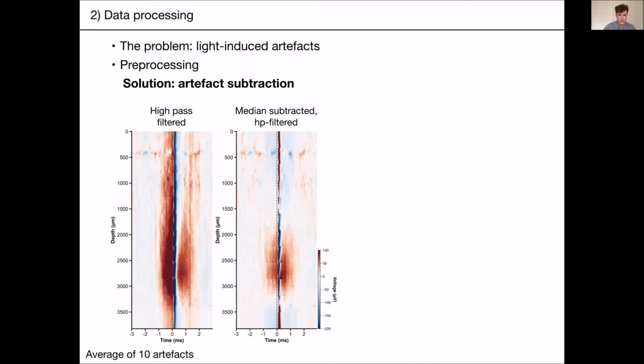So you can see here that you have chunks of channels which seem to be correlated with each other, and you have hard transitions between these chunks of channels. This is due to the fact that on the probe, the channels are not actually acquired simultaneously, they're multiplexed in sub-banks. And this is why Bill Karsh implemented something called Global Demux, which is available in SpikeGLX, and you can run as a Windows application as well, which will do essentially fancy median subtraction, taking into account the difference of timing of these sub-banks of channels being acquired together.